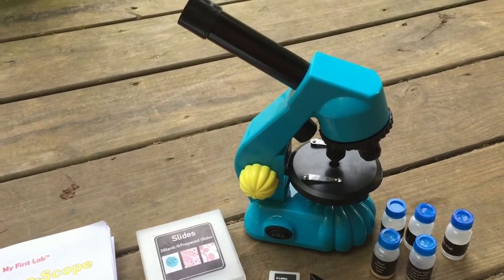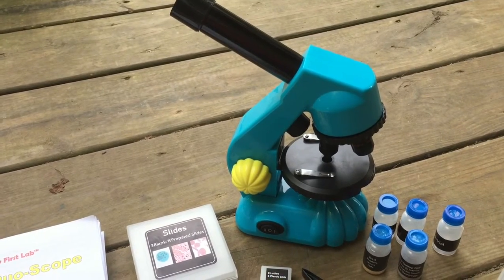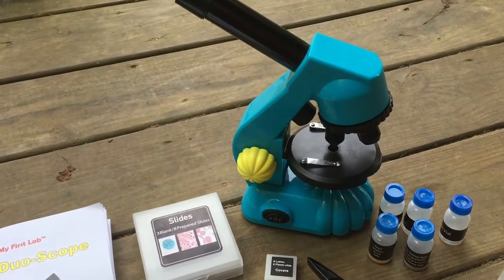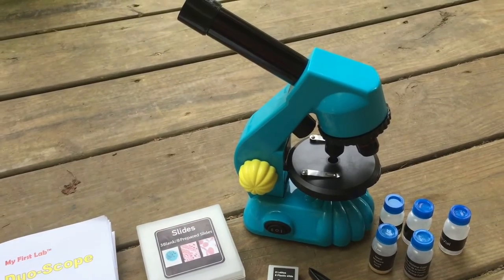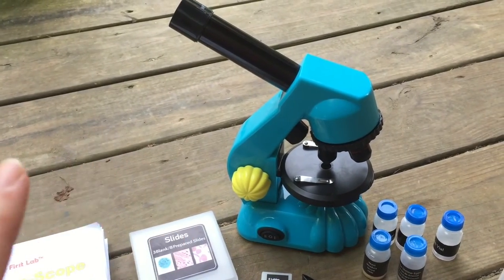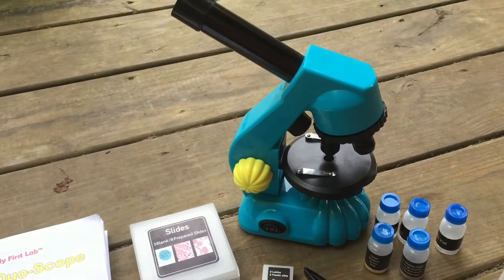I am super impressed with this, so I'm going to show you what comes in the box and then give you a quick preview of how well the magnification works. This is amazing, and the best part is I got it from Amazon for $25 with free shipping. You cannot beat that. So if you have been looking for a way to do some microscope work in your homeschool and haven't been able to afford it, this is definitely something you should check into.